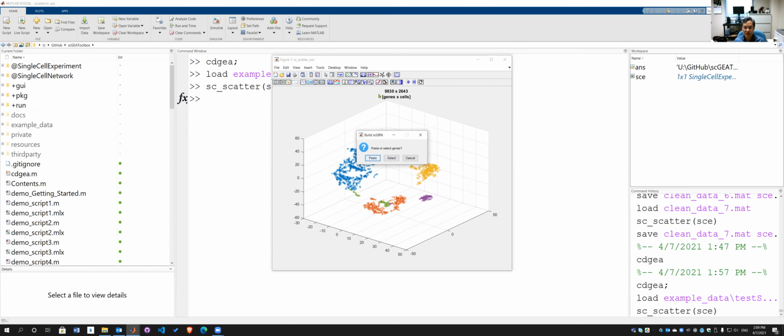So this data set contains 9,830 genes, if you can see my cursor here. So this algorithm will allow you to build this network containing all the genes. However, this is time consuming, and for this small data sample, we really want to select a few genes.